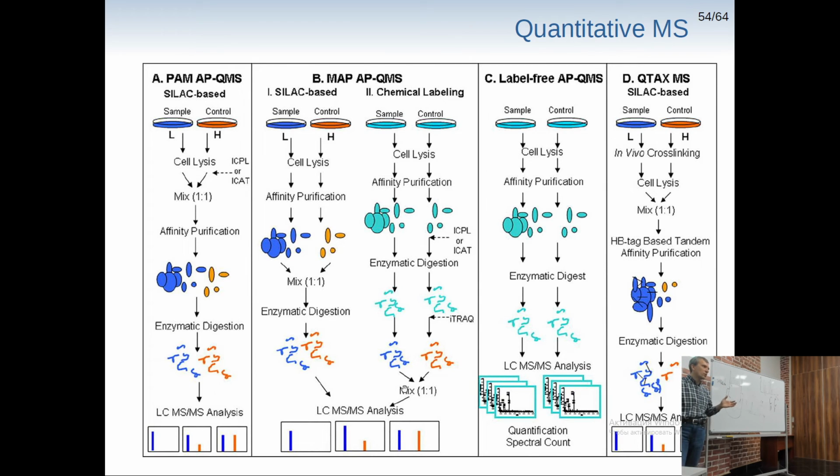There are a lot of label-free approaches. It's nowadays such a modern tendency to sell mass spectrometry which can do quantitative analysis without any labels. Not quite so, actually. But every vendor tries to sell one.